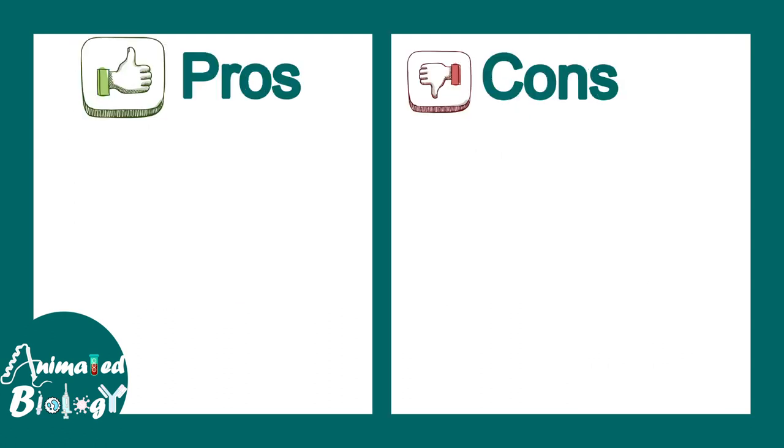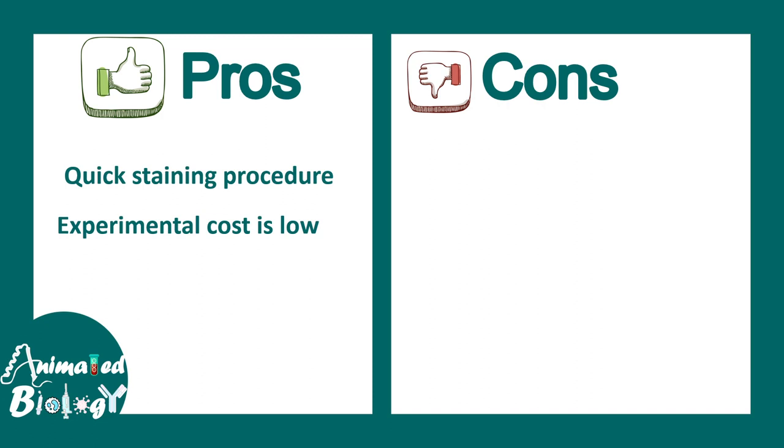Now there are several pros and cons of this technique. For example, it is very quick. The staining procedure is fairly simple, the experimental cost is low, and it has a reliable outcome.